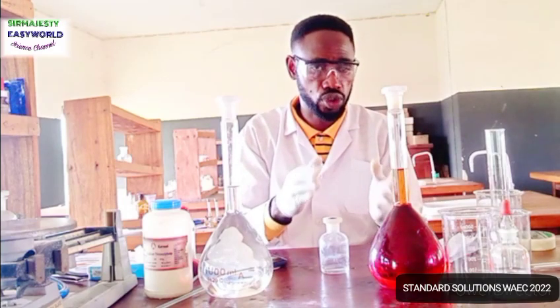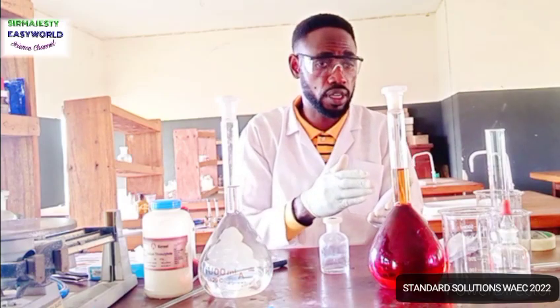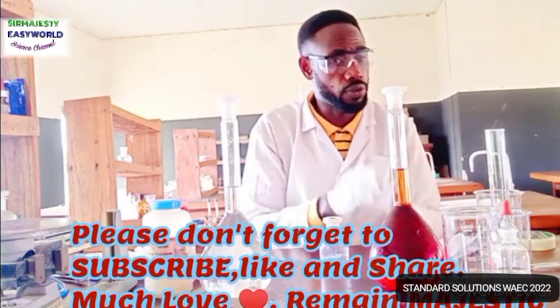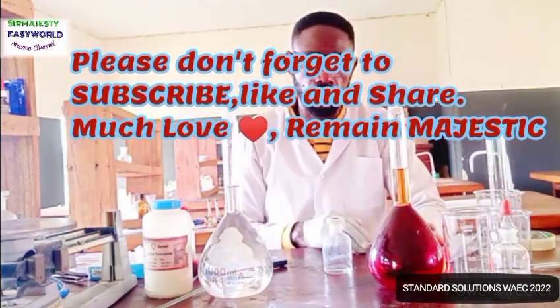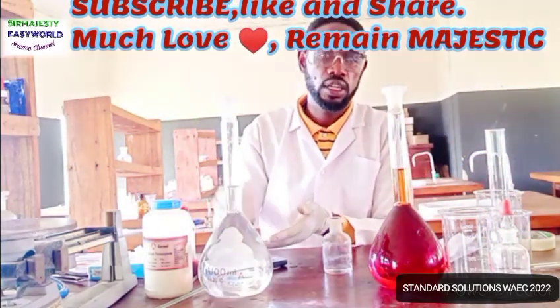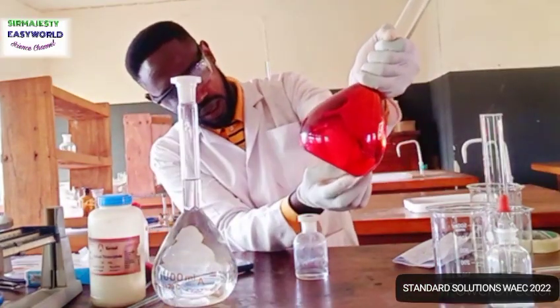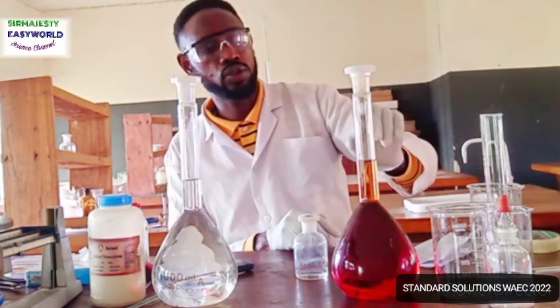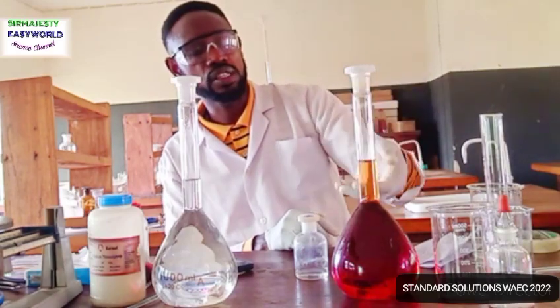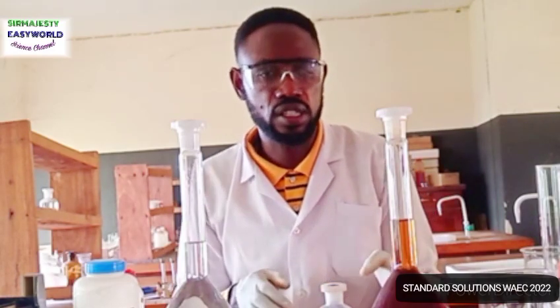And remember, solution is equal to solvent plus solute. So when they say 1 dm³ of solution, it means both solvent and solute, not only solvent. That's why I say you should not make this up to 1000 with water before you start dissolving. No, add it somewhere else and dissolve, then stir well. If you check well, you will still see the iodine is undissolved, and it will remain that way. If I come back tomorrow, all this is already stale, which means the iodine is even evaporating as you are talking. So consecutive titres are not even concordant.